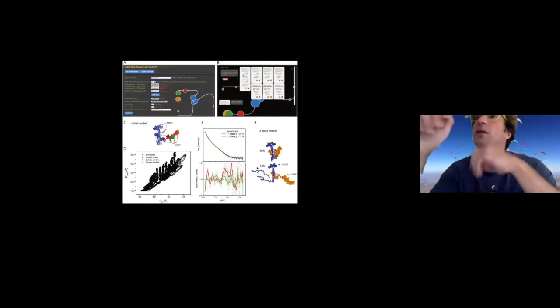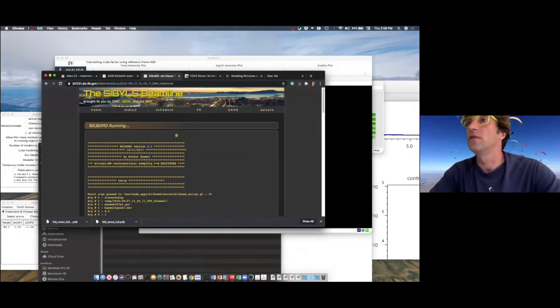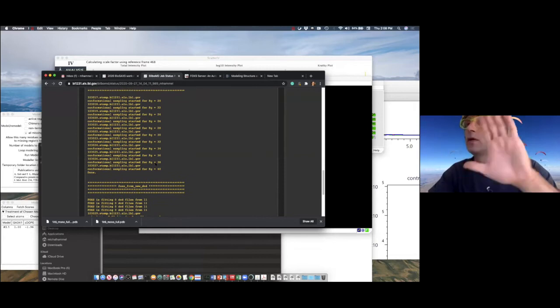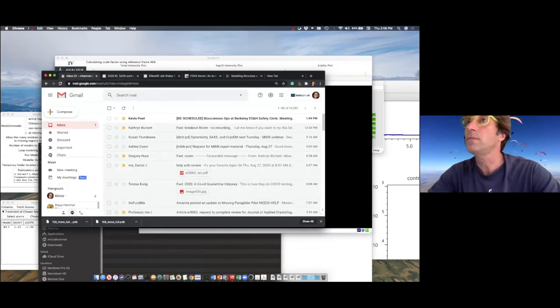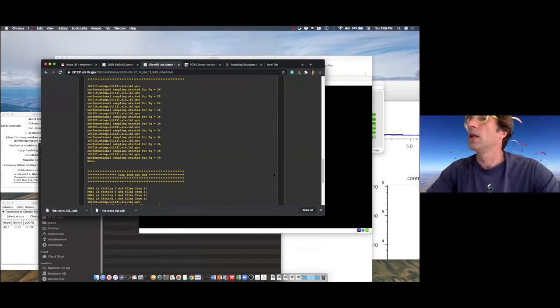And that can be done in one step on a web application. You can see it's doing all those calculations now for you. I chose only a very simple case where only the linkers are moving, no extra domains being added, because this was just for part of the time. Oops, sorry.